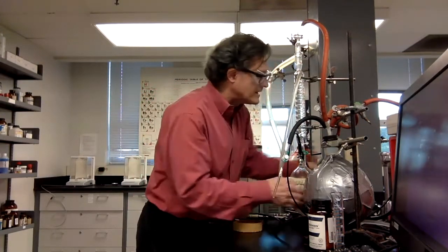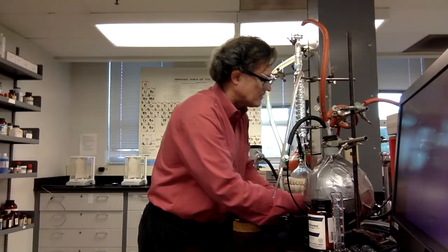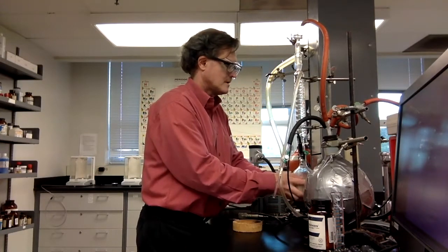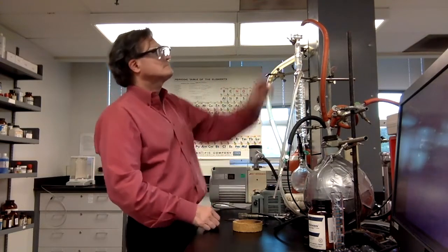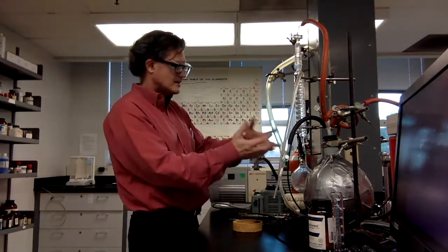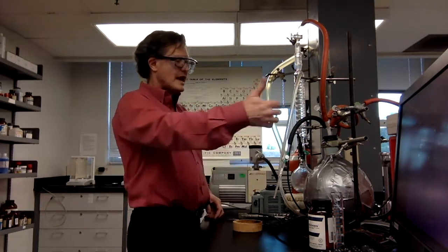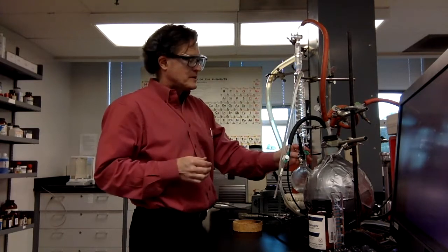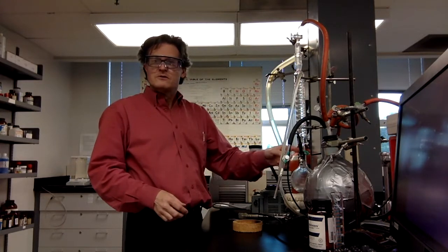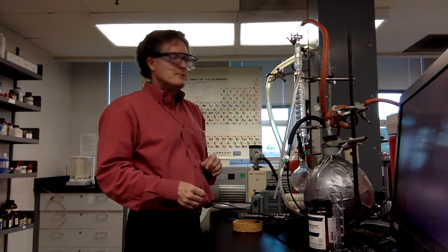We can already take the heating mantle off of here, so that cools down. This is hot. We're allowing that to cool down now as we vent to atmosphere. Right now it's being held together because we've got the little clip on there.